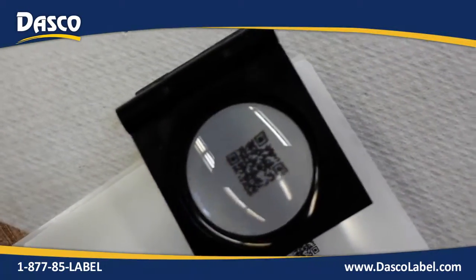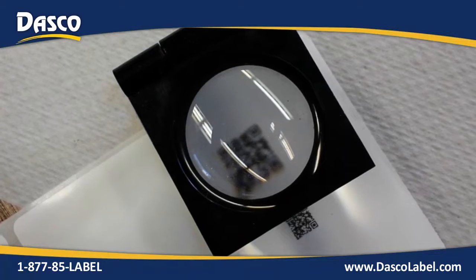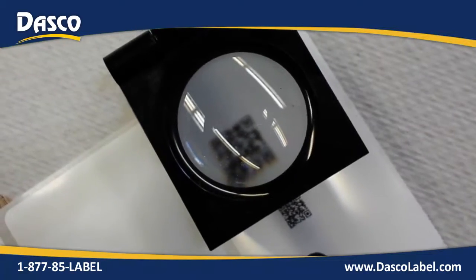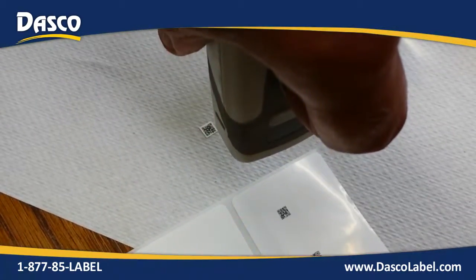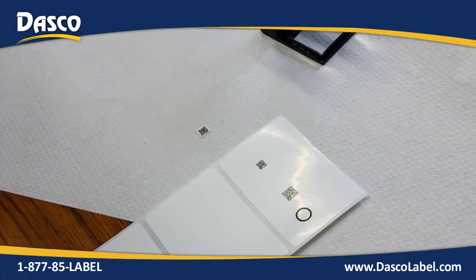It still prints just fine. We're using a thermal transfer printer with a resin ribbon, so it's still getting good resolution. And now it scans, just because the pixels — the squares inside that barcode — are not mushed at the corners. They're sharper. So we're talking the same data, same printer, same everything. We just turned the temperature down. Lots of data, still 2D, and we can read it.